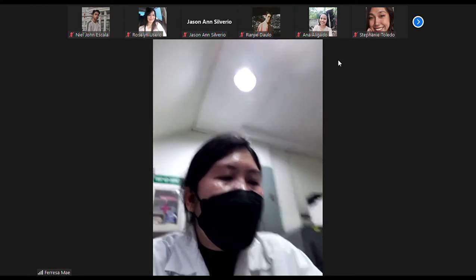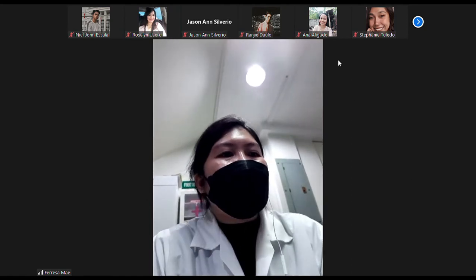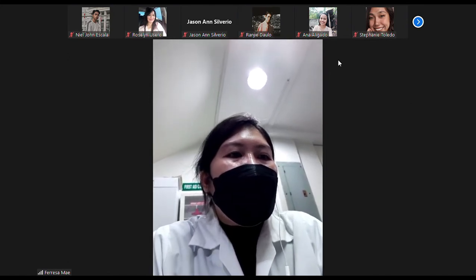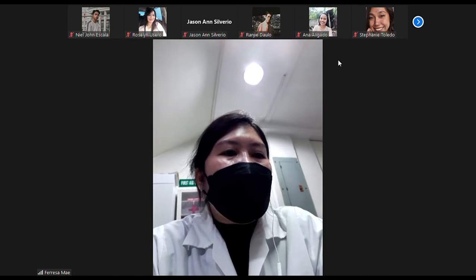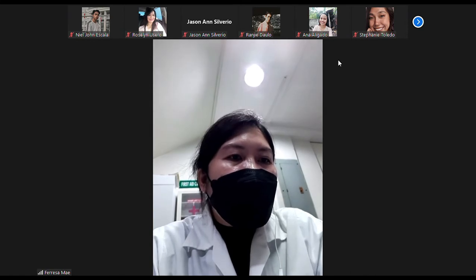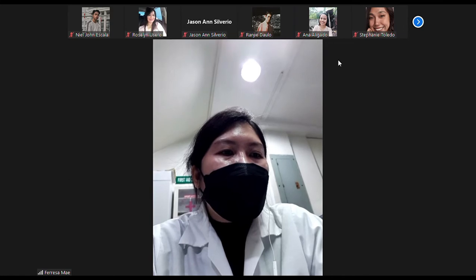There are factors affecting the accuracy of moisture determinations. First, drying temperature. Second, relative humidity of the drying chamber. Third, air movement in the drying chamber. Fourth, vacuum in the chamber. Fifth, depth and particle size of the samples. Next is the drying oven construction, number and position of samples in oven, and the diameter and type of container.